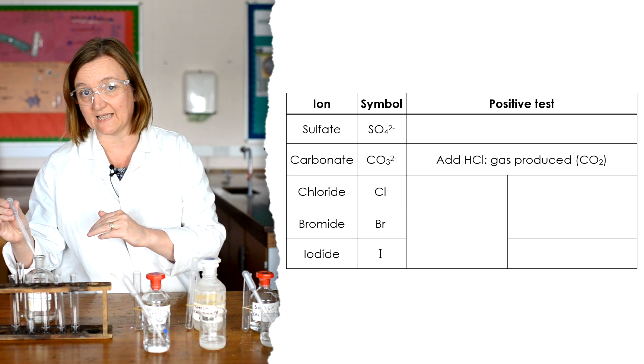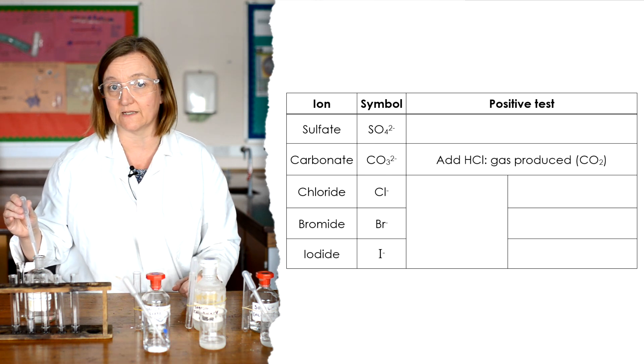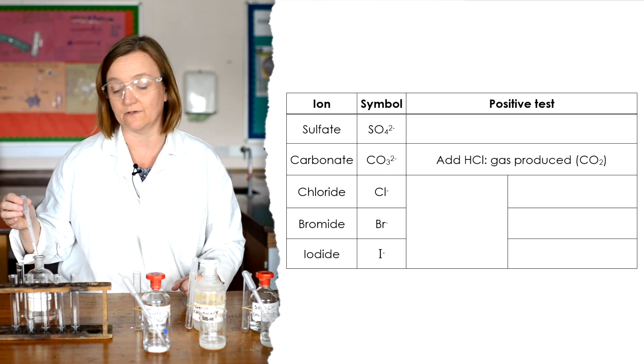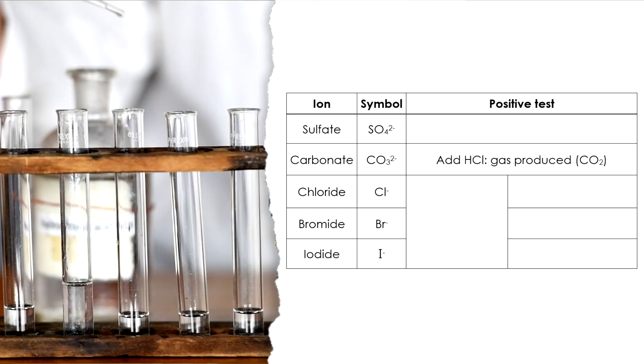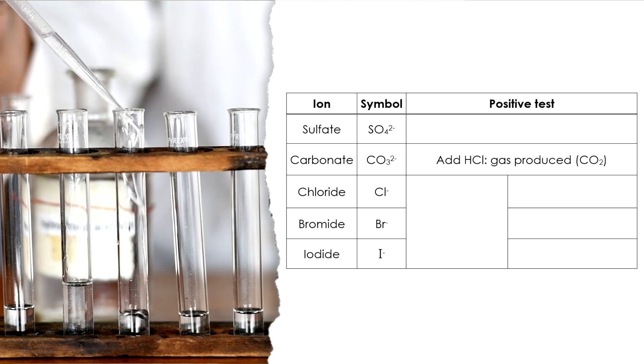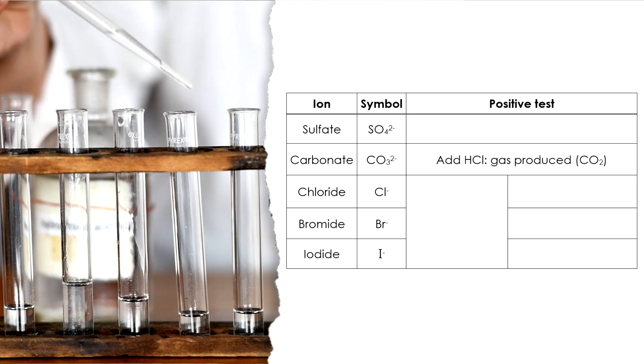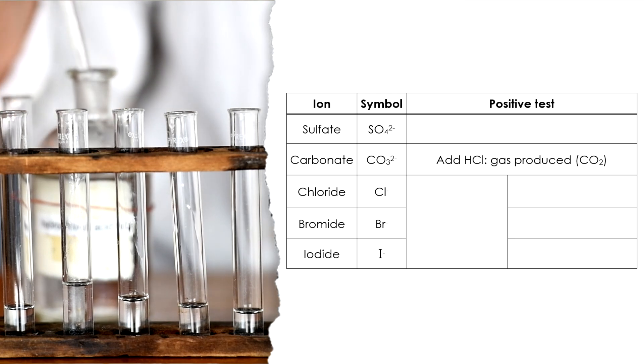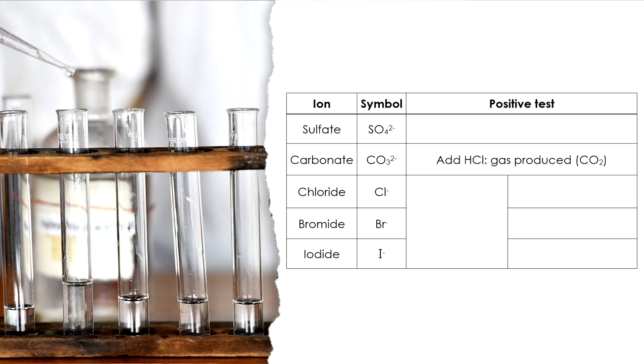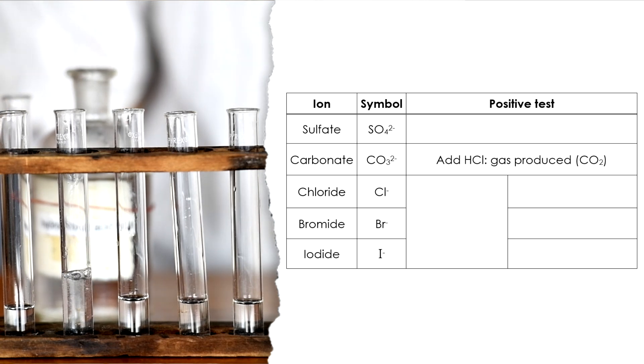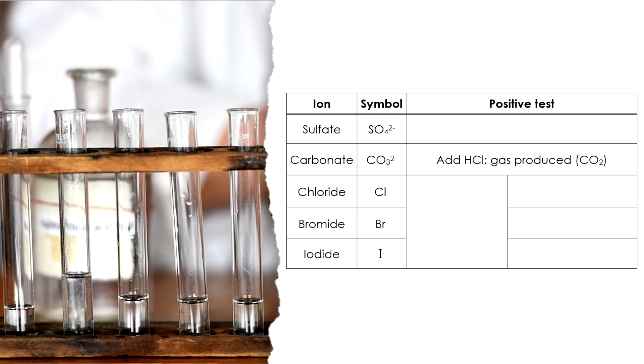We could try and collect some of the gas and prove it's carbon dioxide by bubbling it through lime water, but I won't do that today. But we'll test the other ones as well. Remember the next one, sodium chloride. Not a lot happening. Sodium bromide. Still really nothing very much happening. And finally, sodium iodide. So the only one that gives us a positive test, where we get the fizzing and the carbon dioxide bubbles produced, is the carbonate ion.